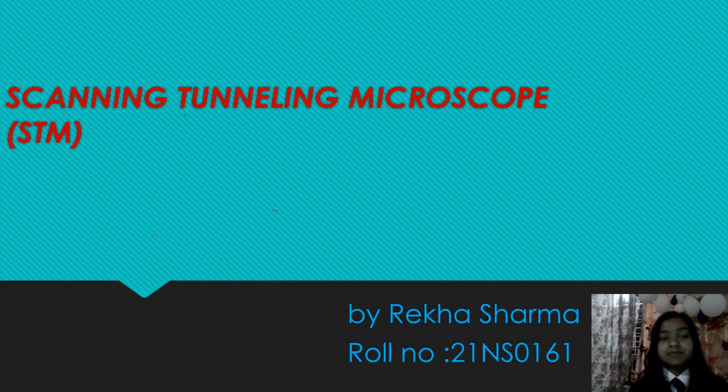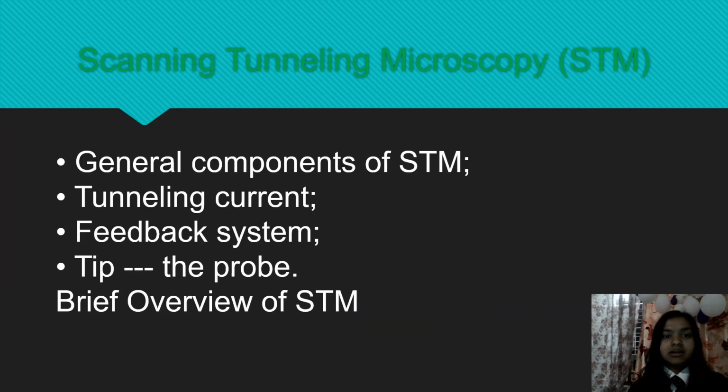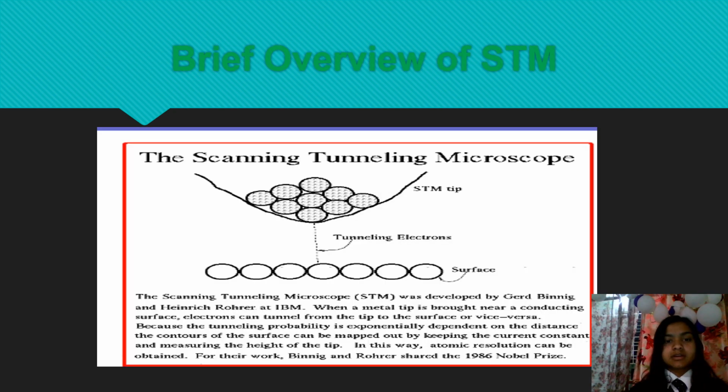I am presenting a presentation on the topic STM, that is scanning tunneling microscope. Today we are discussing the general components of STM, tunneling current, feedback system, tips, and a brief overview of STM. First, let's discuss what is STM, that is the scanning tunneling microscope.